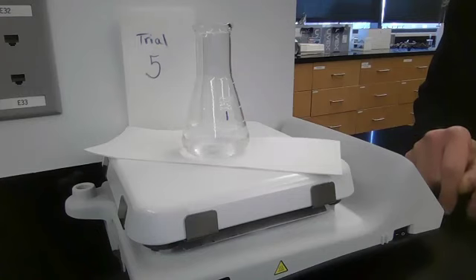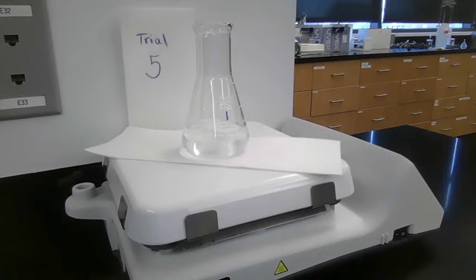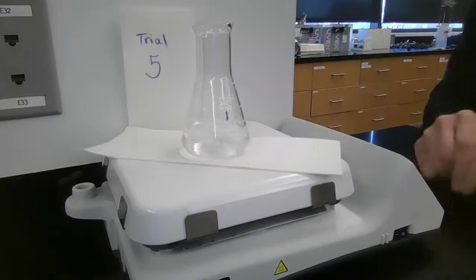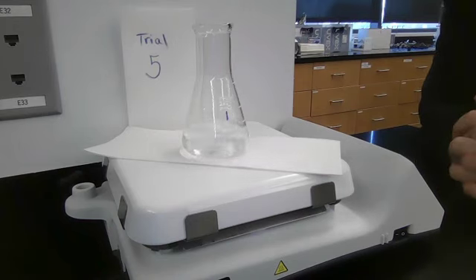Watched iodine trial never turns purple. I better look away. Did you put the starch in? I believe I did. All right then. There's always that question though, isn't there? Do you need these other trials or shall I clean up?